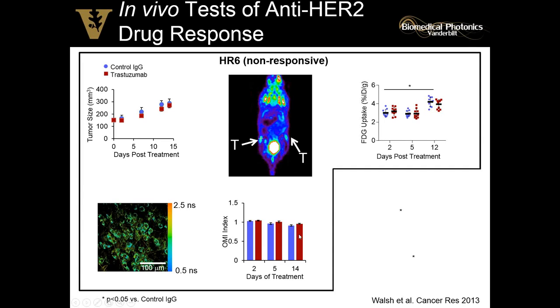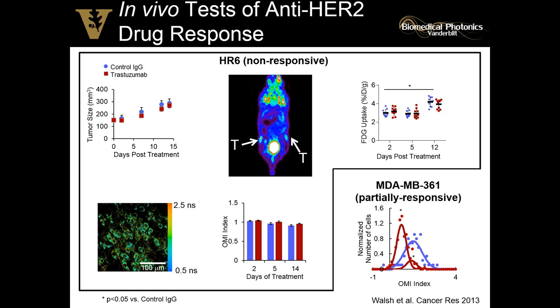So this indicates that we can resolve not only response but a lack of response due to the changes in the fluorescence lifetime of NADH and FAD. And finally, we looked at a partially responsive tumor model.